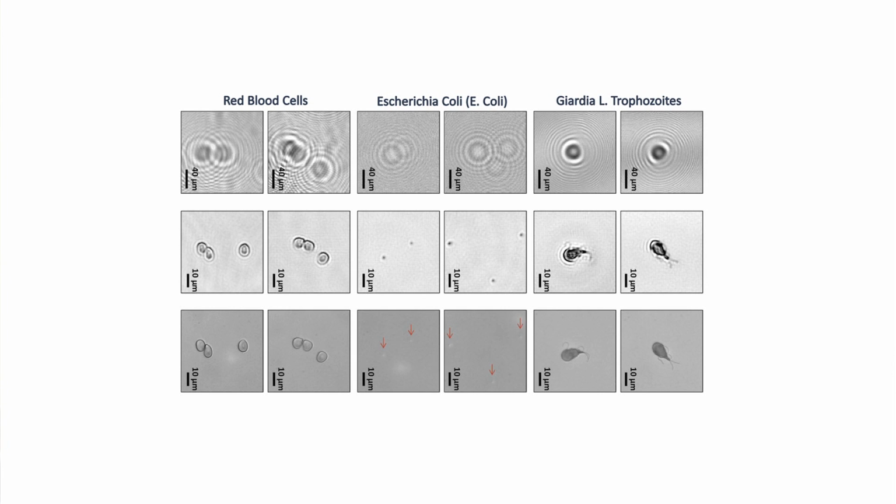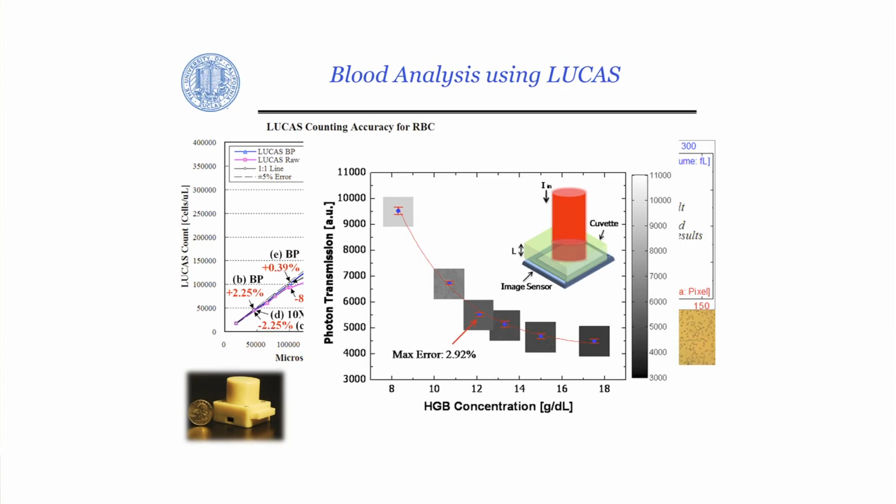coli particles, some waterborne parasites, and everything you compare to a conventional microscope to see if you've imaged really apples for apples. And because everything is digital, you can also make this work as a blood analyzer for counting and looking at cell densities per microliter using a very inexpensive and field portable design as shown here.